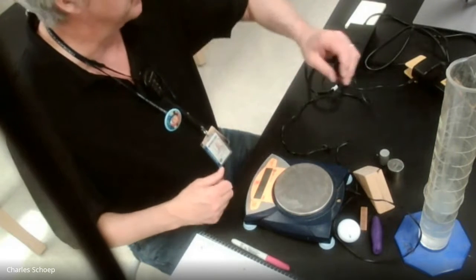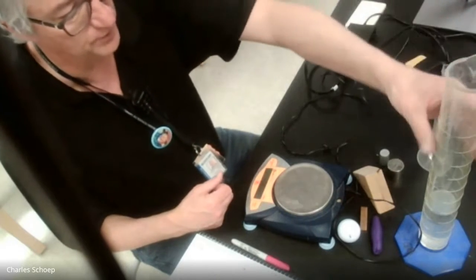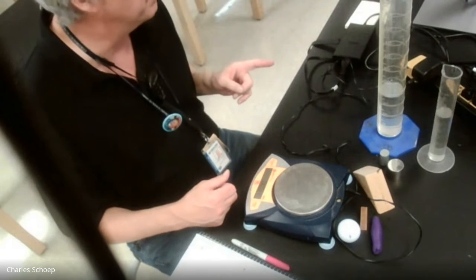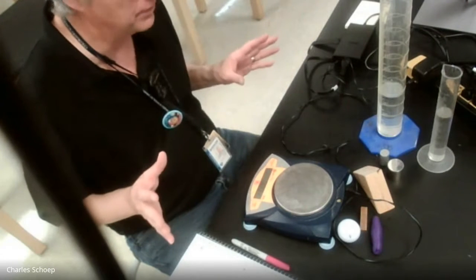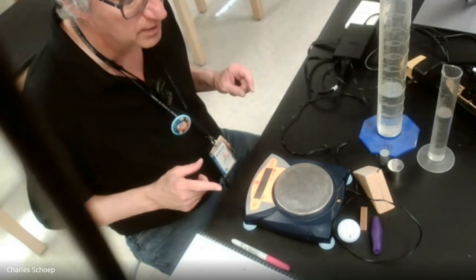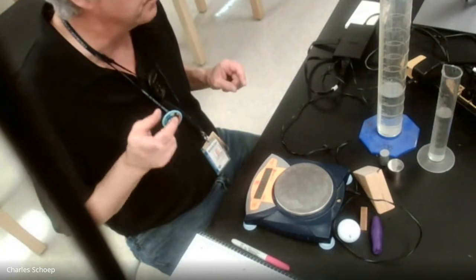And being the smart Chucky that I am, I've got a couple of graduated cylinders of a couple of different sizes, because I think if I want to measure volume, I'm going to need those. So all we're going to do in this video is we're going to get some volume data, and then we're going to get some mass data.